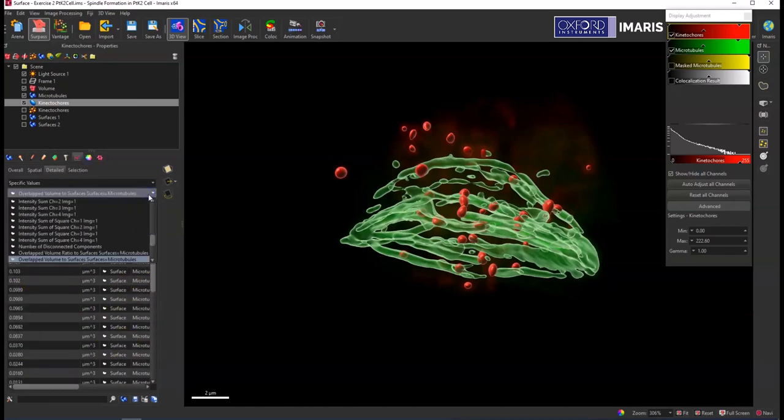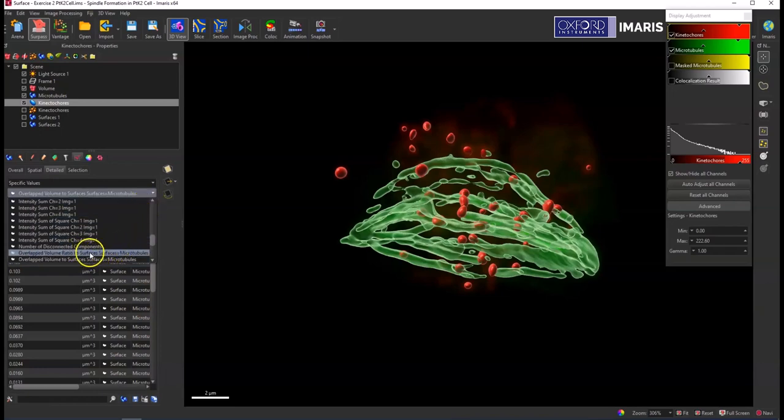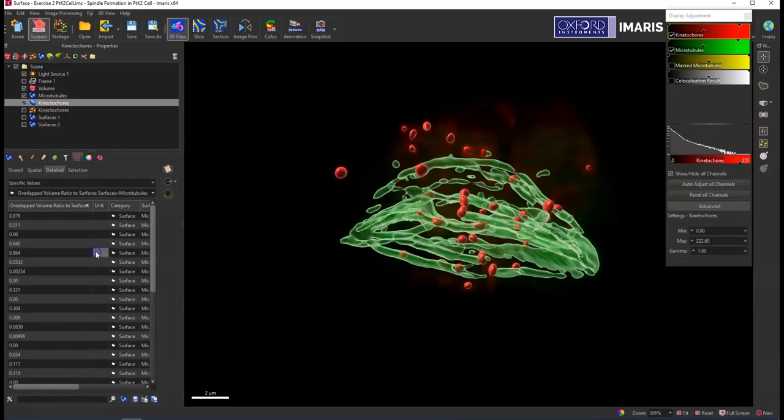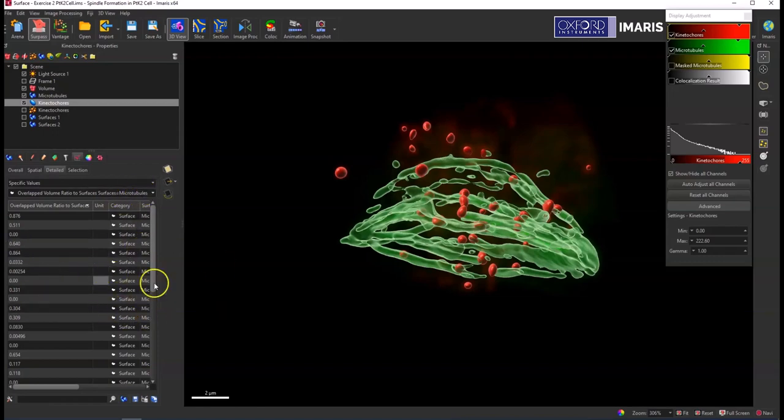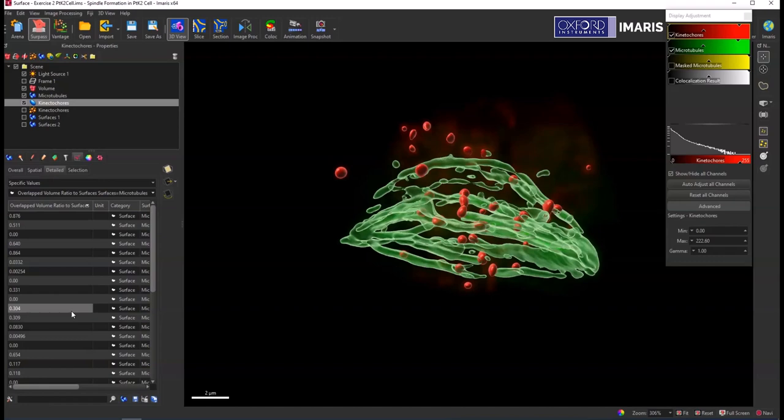There's another really similar statistic to this one which is the overlap volume ratio to surfaces. This one will actually compare the volume of the microtubule surface to the volume of the kinetochore surface and how much is overlapping between those two nearest objects and give you an actual ratio of that overlap.